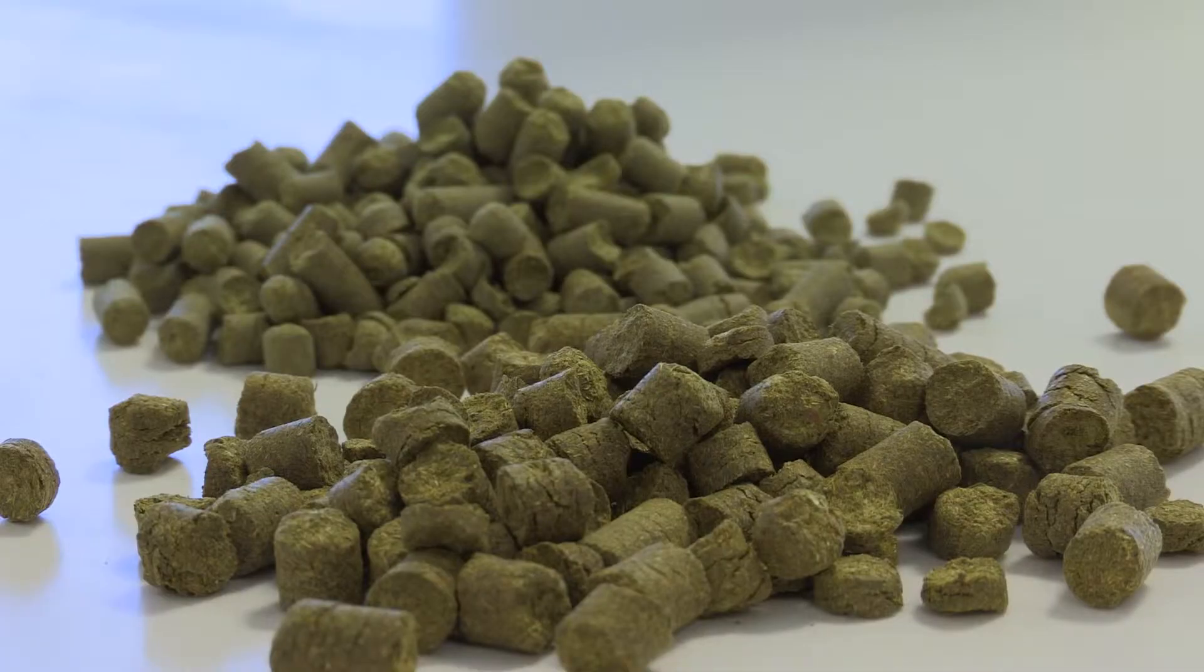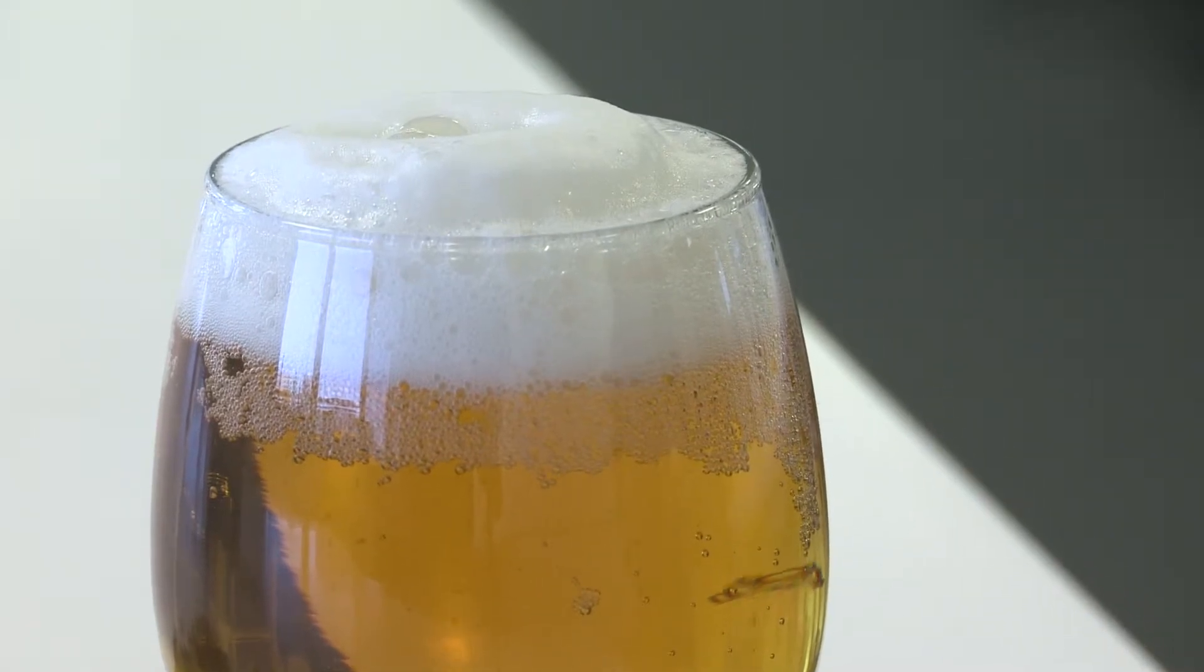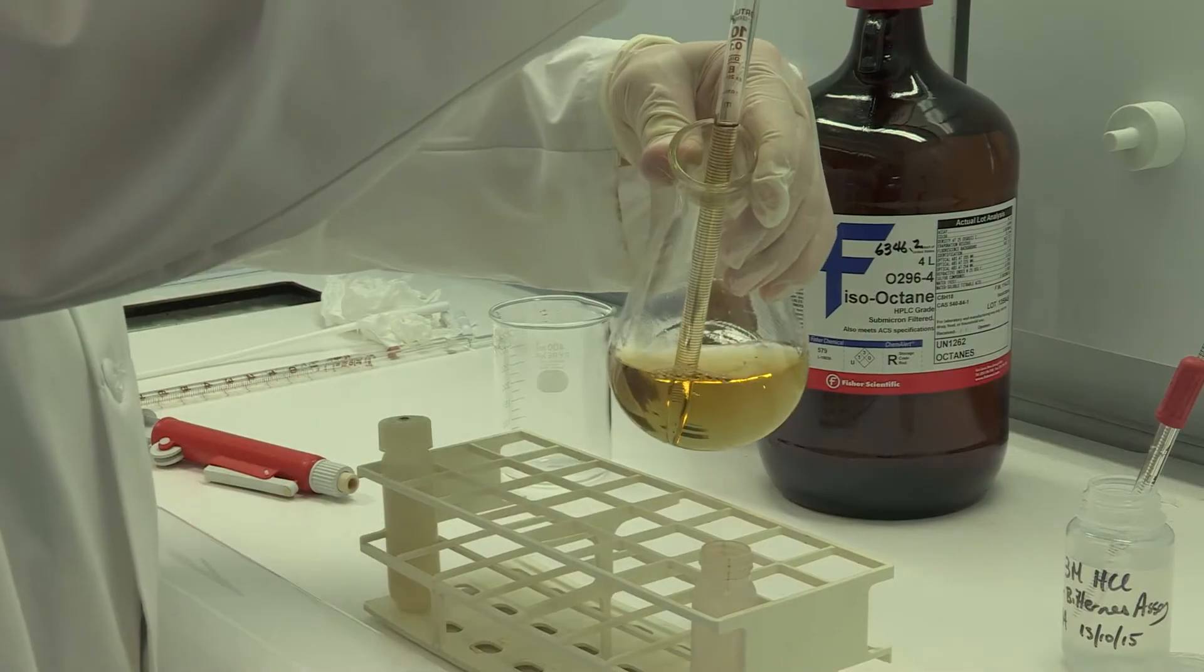The important aspect of measuring bitterness in our beer is that we don't produce foam. Foam contains significant amounts of iso-alpha acids, so they'll be lost during excessive foaming.